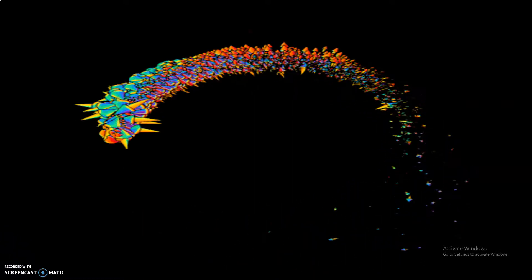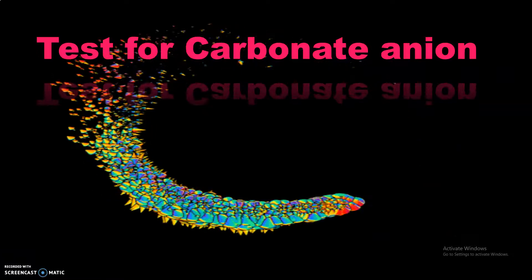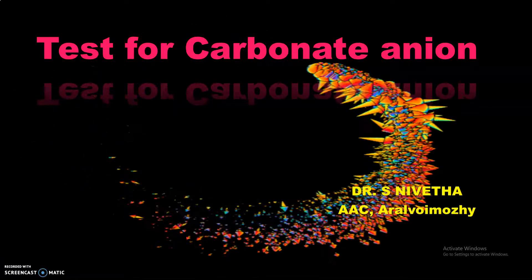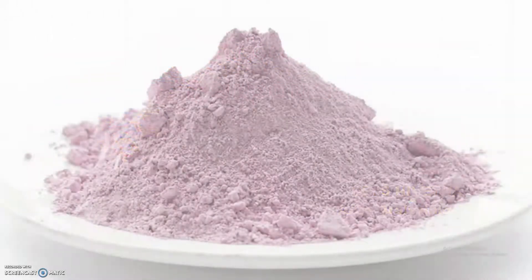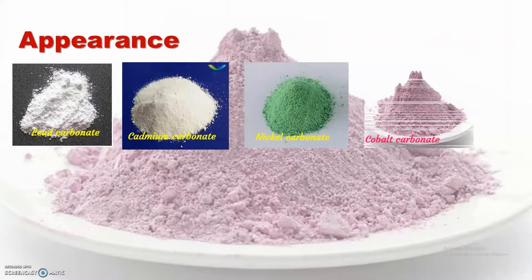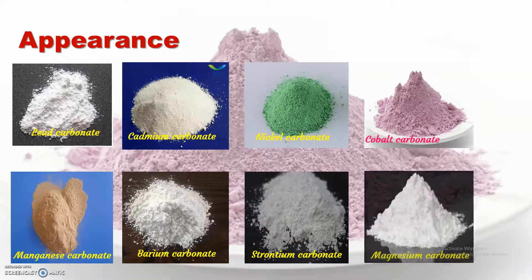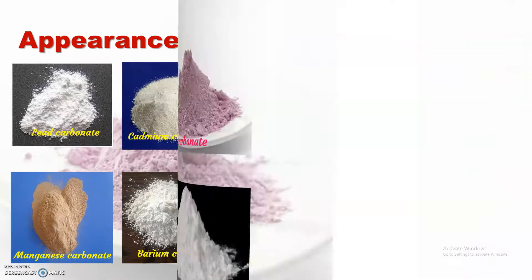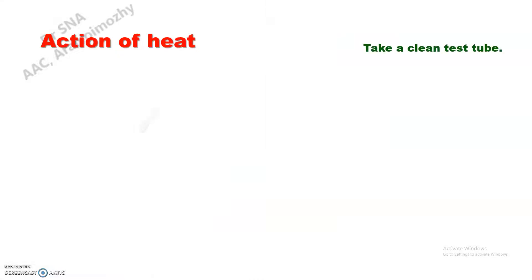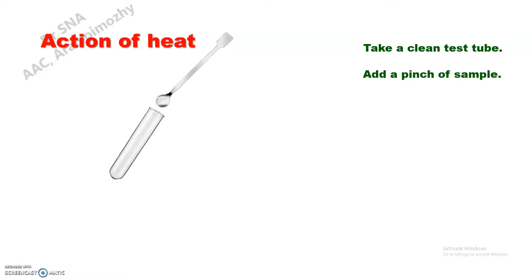Test for carbonate. First, we can see the physical appearance of some carbonate salts. Carbonates are mostly amorphous in nature. Next, the chemical properties. First: action of heat. Take a clean test tube and add the sample.